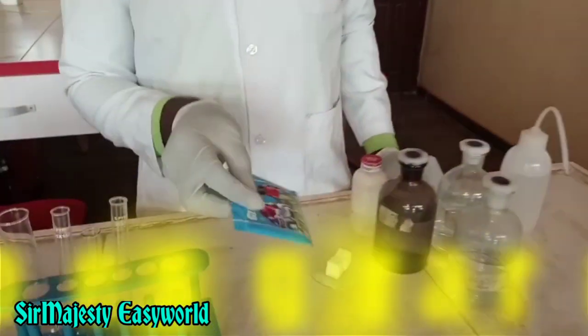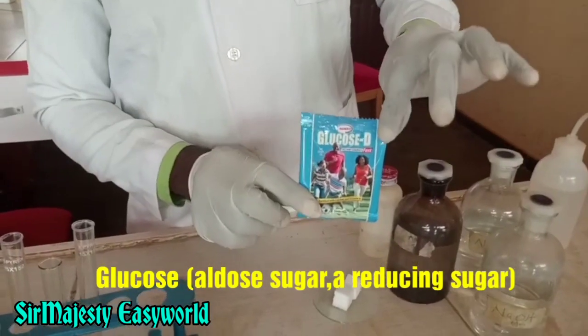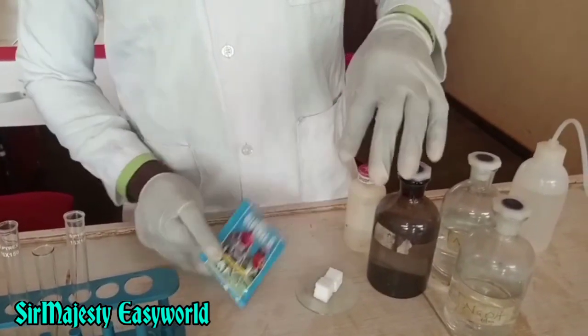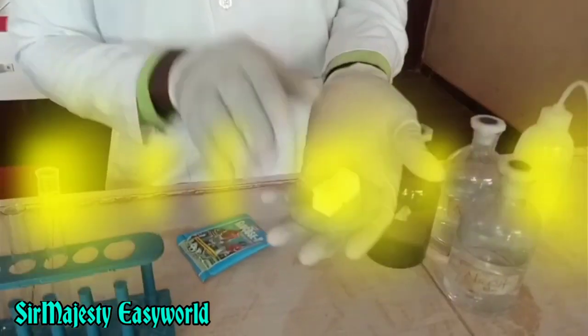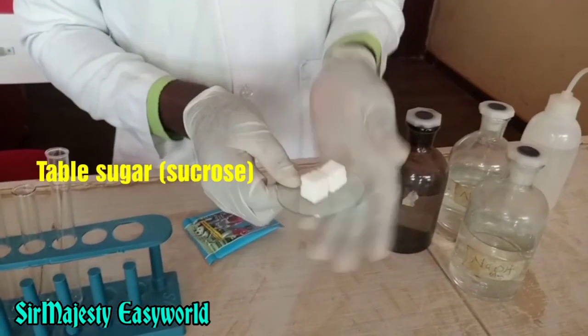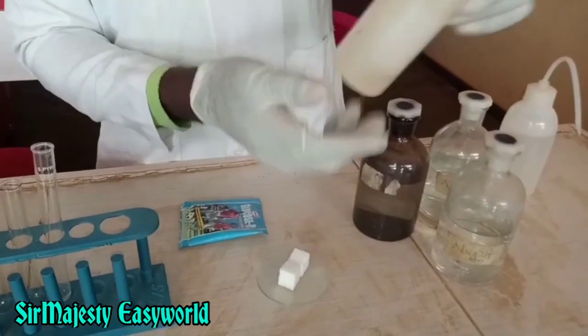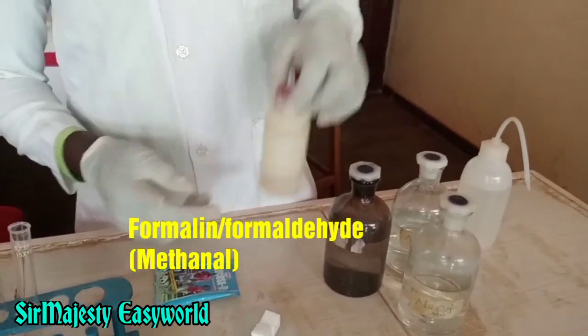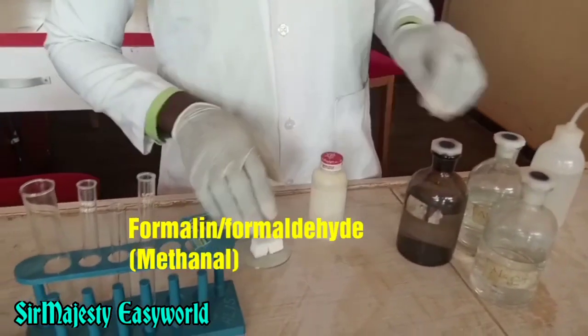Here we have the test samples. Here is our glucose, which contains the aldehyde group — that is the aldehyde group. And this is sucrose, the table sugar, which is supposed not to contain it if it did not undergo hydrolysis. So we'll use this as a control experiment. Over here is our formaldehyde, which also contains the aldehyde group.